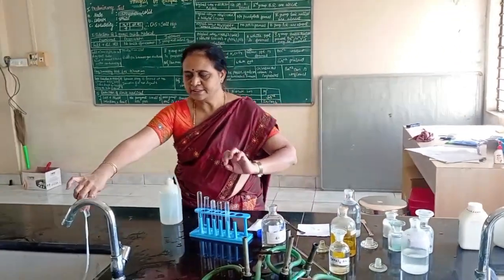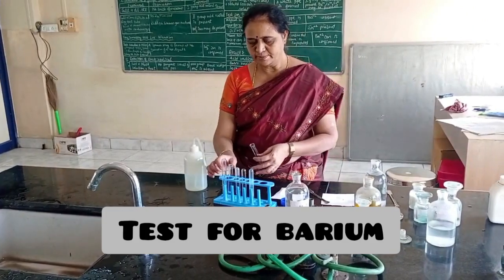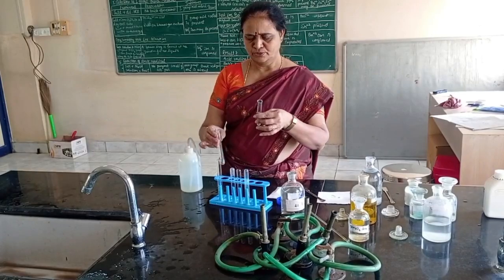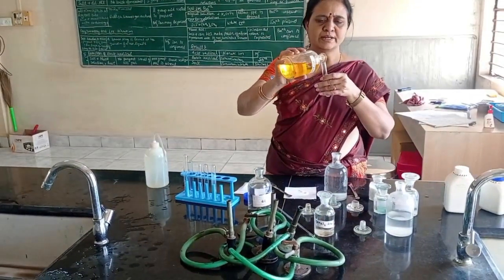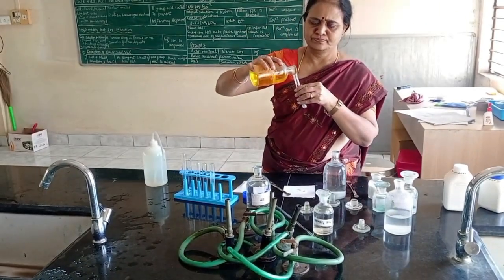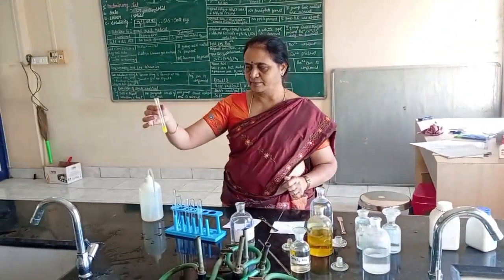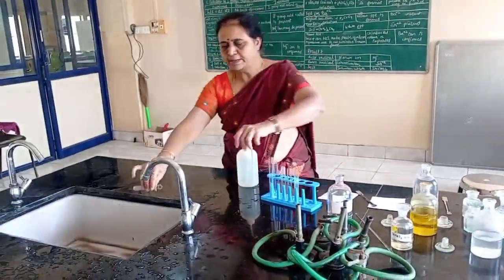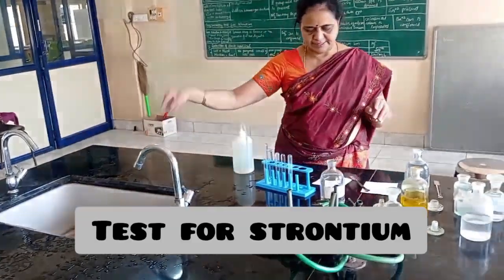Now I am testing for the presence of barium. For this, I am taking 2 drops of original solution and adding potassium chromate. No precipitate is formed. I am getting only yellow solution. So barium is absent.